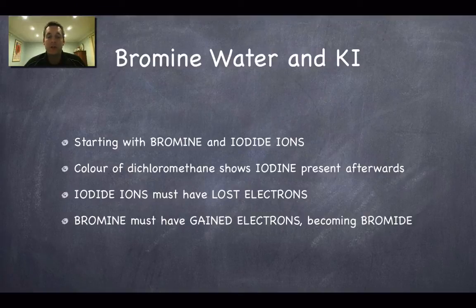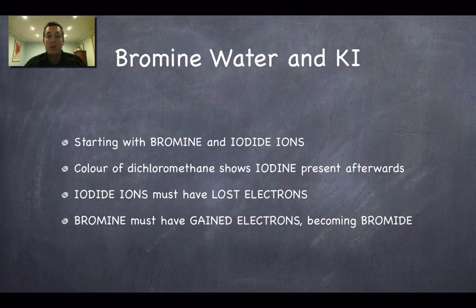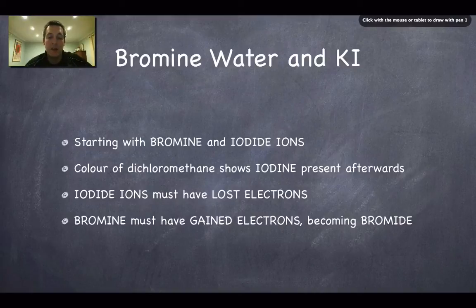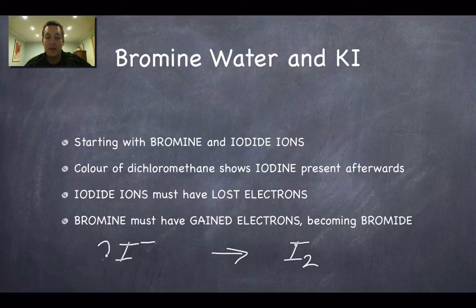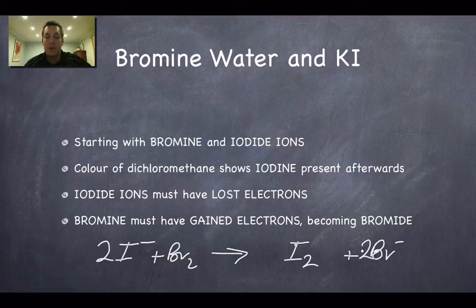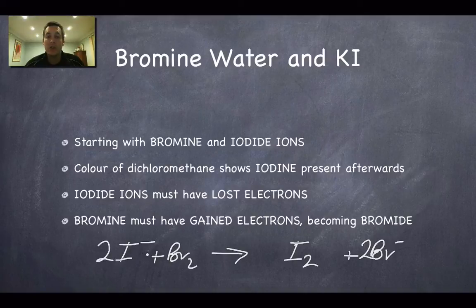Finally, for the reactions, we mixed bromine water with potassium iodide. So we started with bromine as the halogen element and iodide as the halide ion. Once again we can see a pink or purple colour in the dichloromethane, indicating that iodine is present — so there has been a reaction. The iodide ions lost electrons and turned into iodine, while bromine gained those electrons and became bromide ions. So bromine was able to oxidise iodide. Whilst iodine wasn't a good enough oxidising agent to oxidise bromide, bromine is a good enough oxidising agent to oxidise iodide.